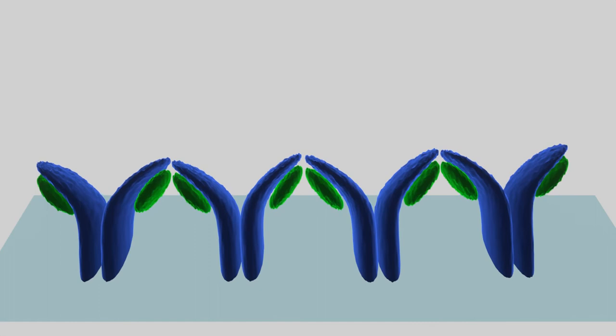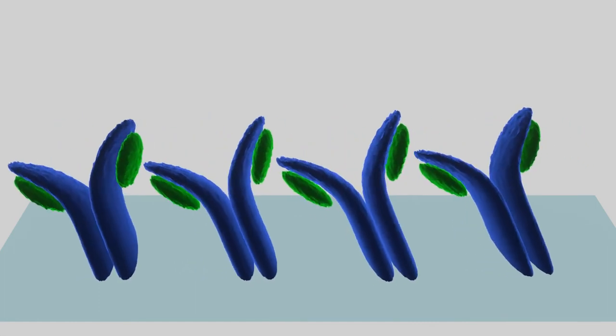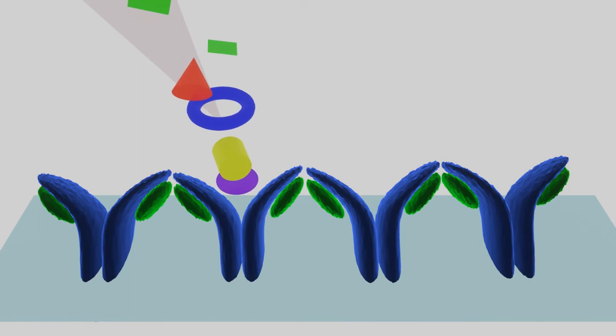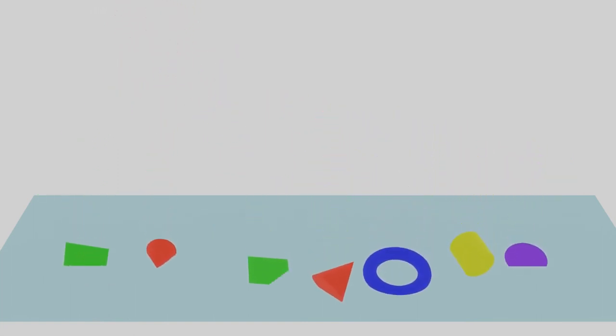So, we can improve the specificity by first sprinkling the surface with an antibody. Note that the antibody binds to the surface simply because it is sticky. This has nothing to do with its antibody properties. Next, add the antigen mixture.